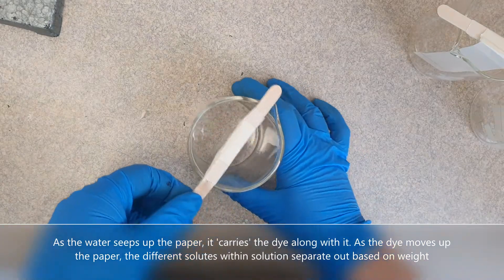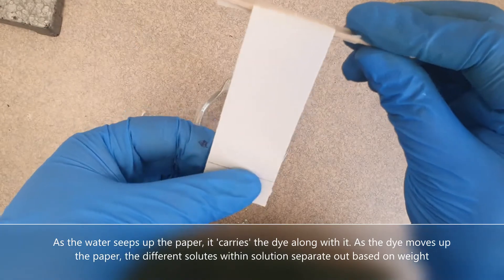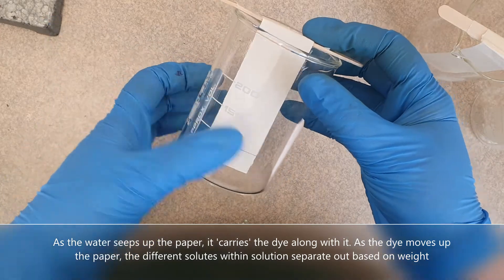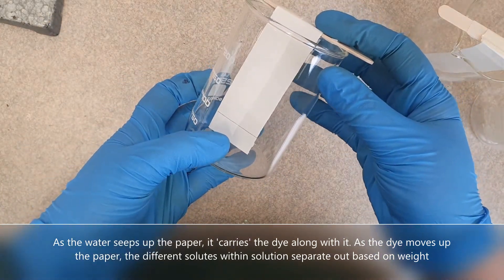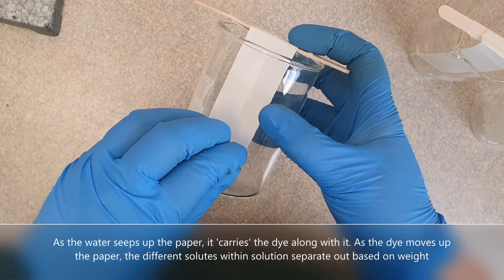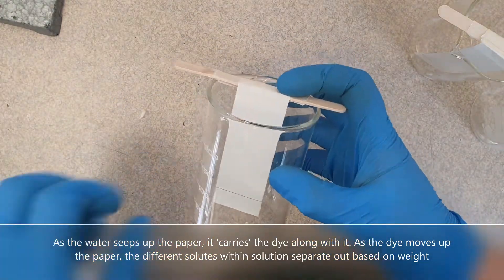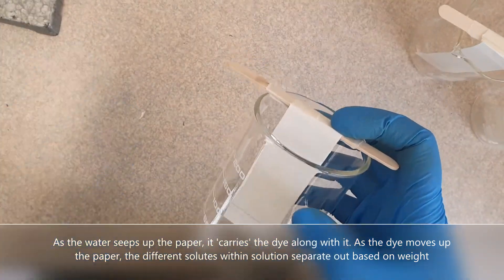I've got a beaker, and the chromatography paper is hanging off a pencil stick so it sits inside the beaker like that. I'm going to put a little bit of water in the bottom and the water will slowly seep up the paper. Think of it like wearing long pants that get stuck in mud — the liquid crawls up your pants. That's like chromatography.